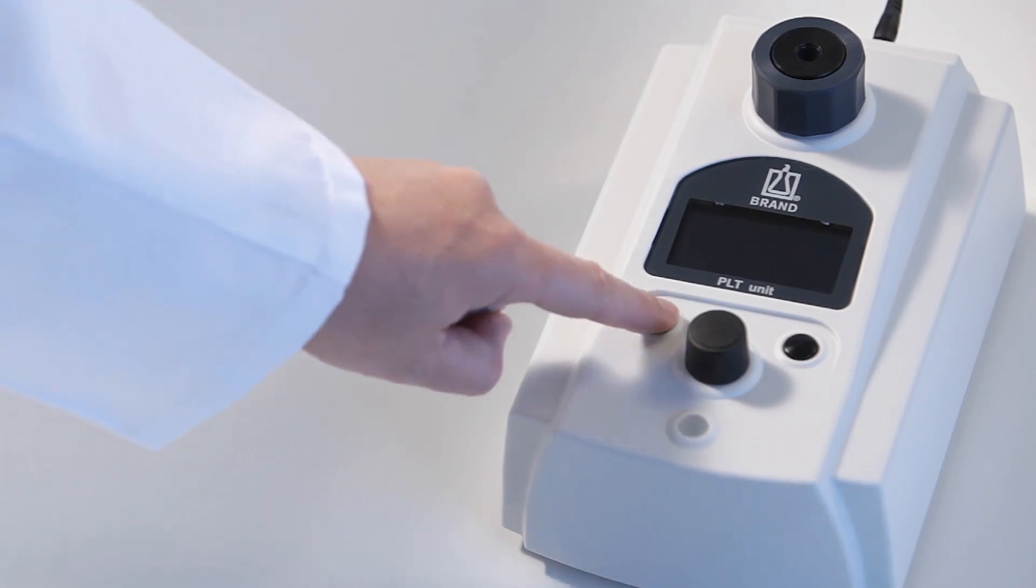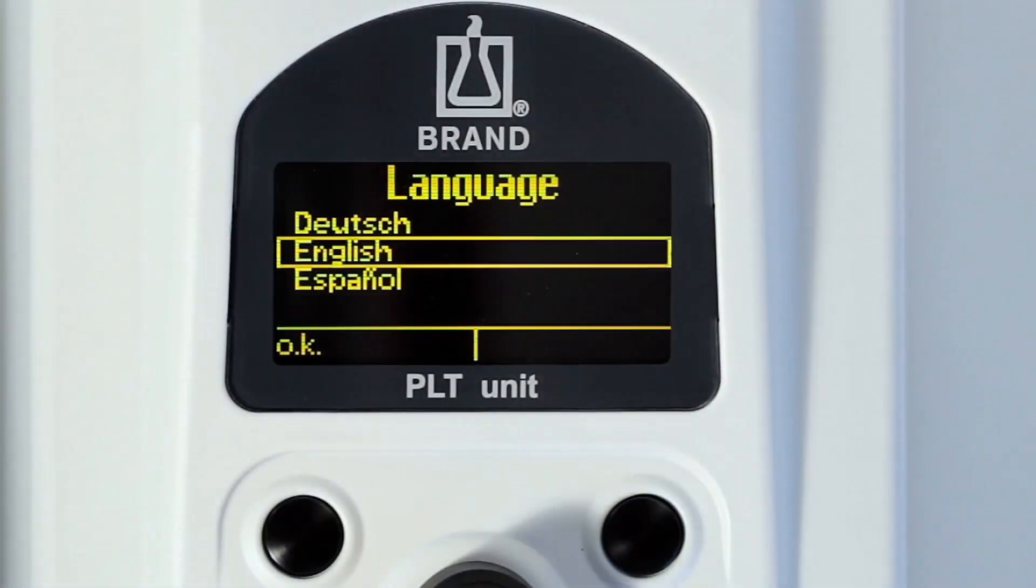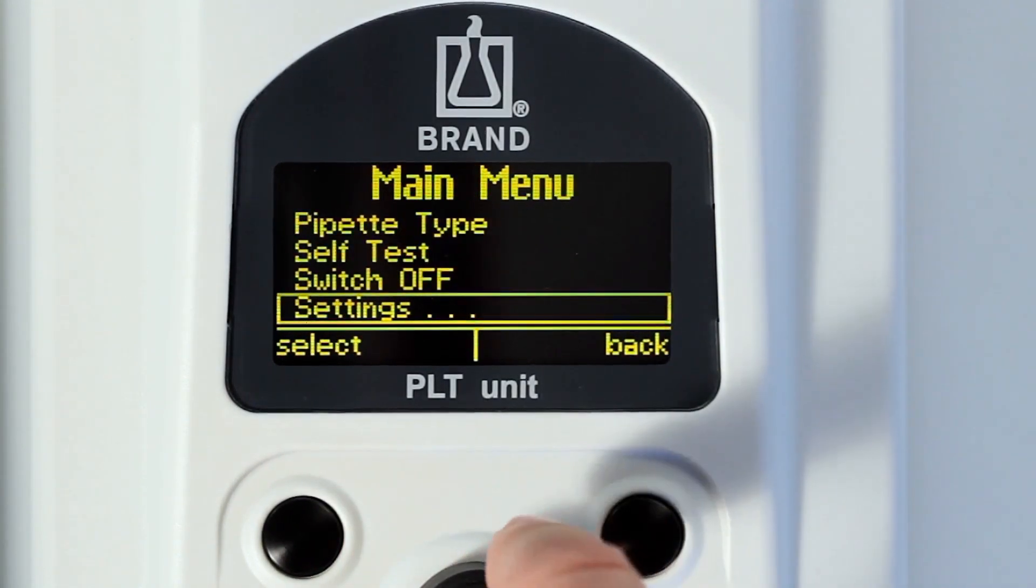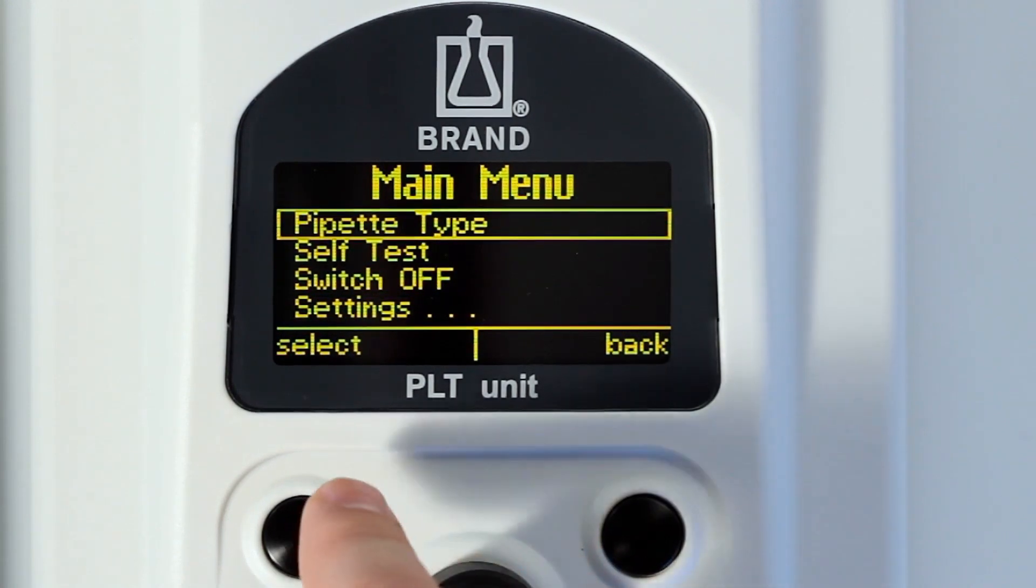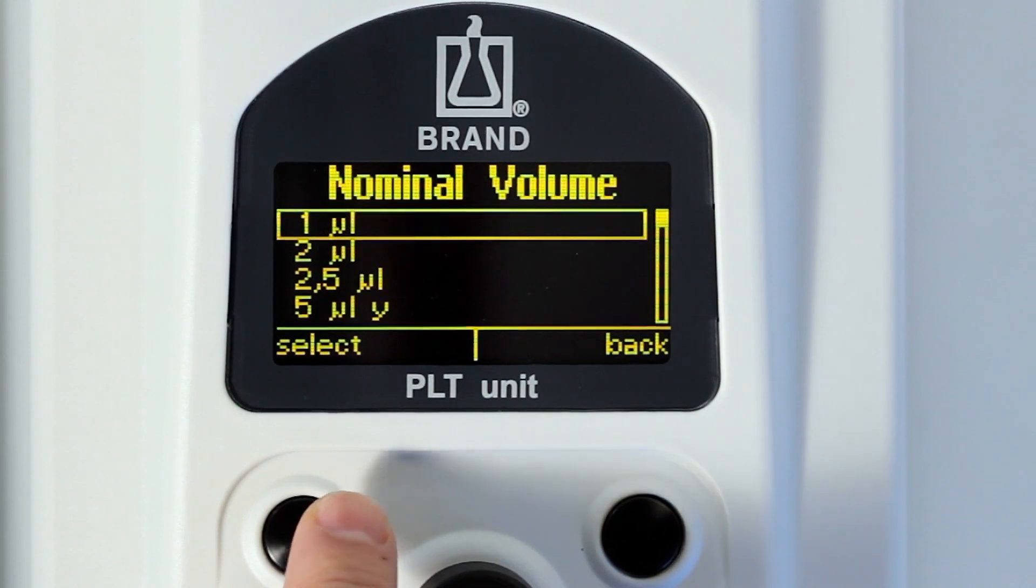First, switch on the unit. Then select the language, the pipette type, and the volume.